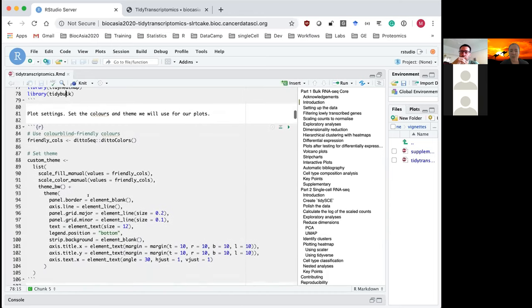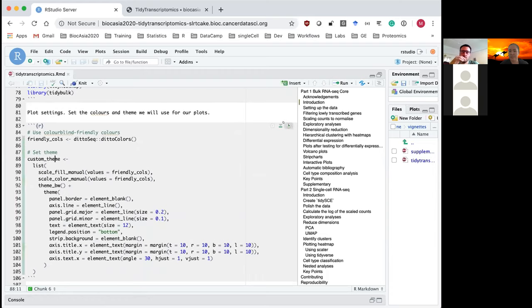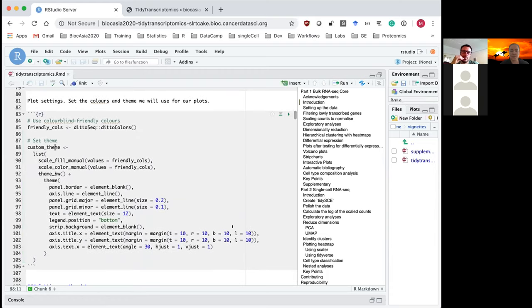This code chunk sets up the colors and a custom theme I'm going to use in the plots we'll be making in this workshop. I'm going to run that now.